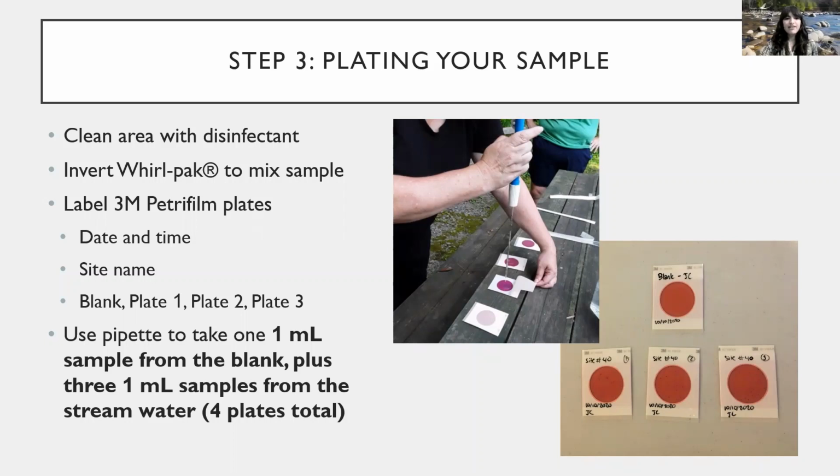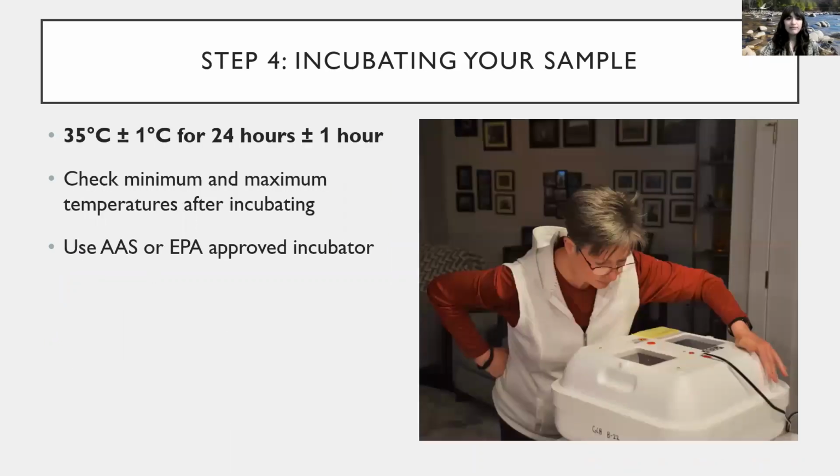Okay, step number 4, we're going to incubate our plates. So you'll use an AdoptAStream or EPA recommended incubator to do this. We recommend that you play around with your incubator beforehand and get to know it, because they tend to be temperamental sometimes.